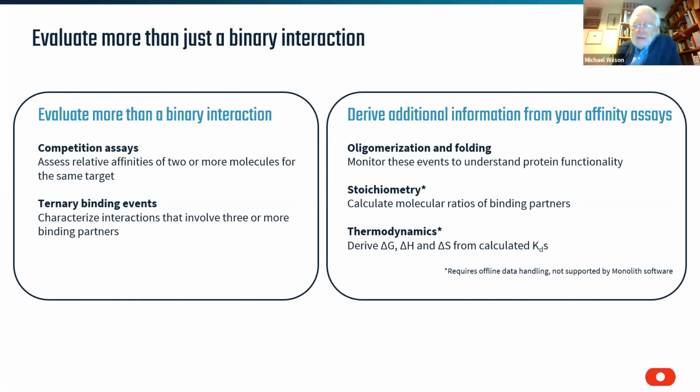Another one. I see you got thermodynamic things down there. So you do that by changing the temperature of the actual. So your whole thing is temperature control. Although you change the temperature, is there a basic set level that you change that for? Yes. So it actually depends whether it's the Monolith or the Dianthus. The Monolith, you can temperature control from 22 to 40. So you could do it at different temperatures. The Dianthus, because it's been designed with screening in mind, it's a bit more limited in temperature. So I think it's 20 to 25.